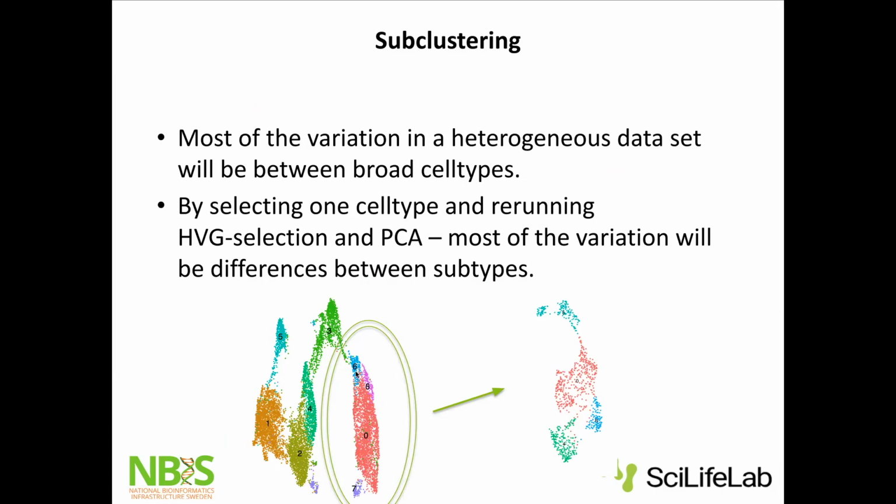My best recommendation is really to do differential expression between these three clusters, see if they make sense or not, to decide if the splitting of these clusters is what you should do. Also look at QC stats, if it's mainly just low quality cells in this cluster that are separating. Look at cell cycle, is it mainly cell cycle signal, or are different batches separating them? So that's more or less what you're stuck with.